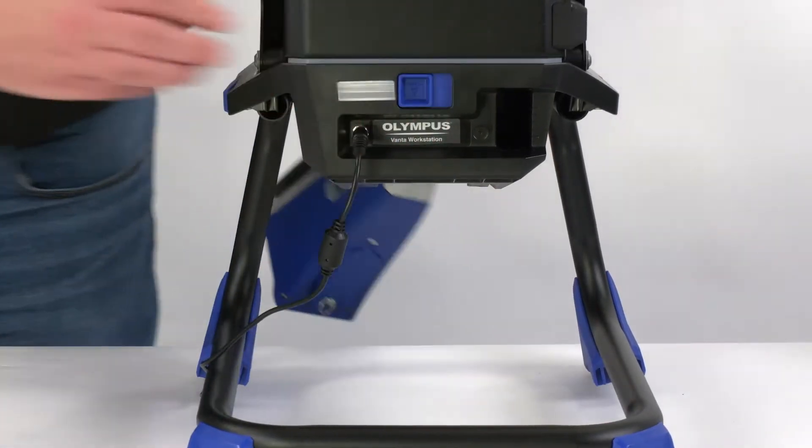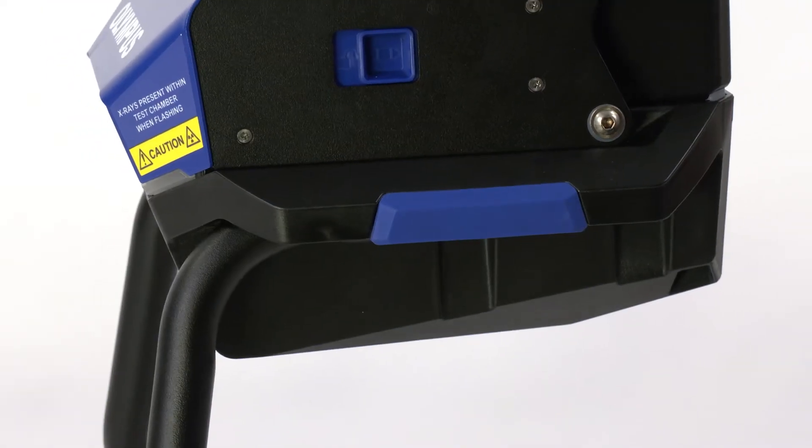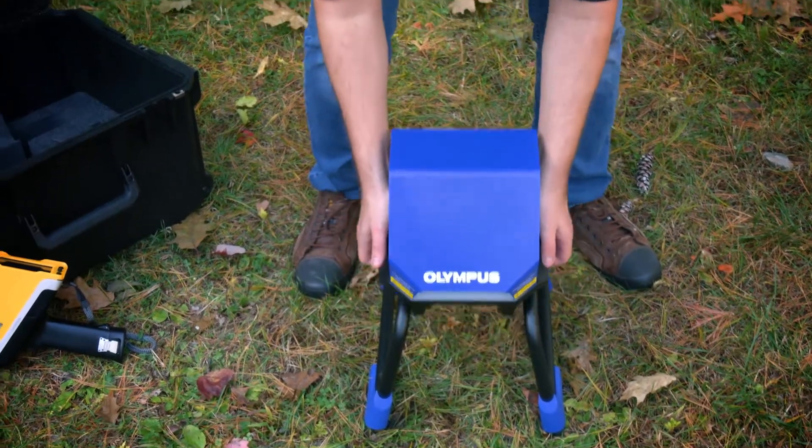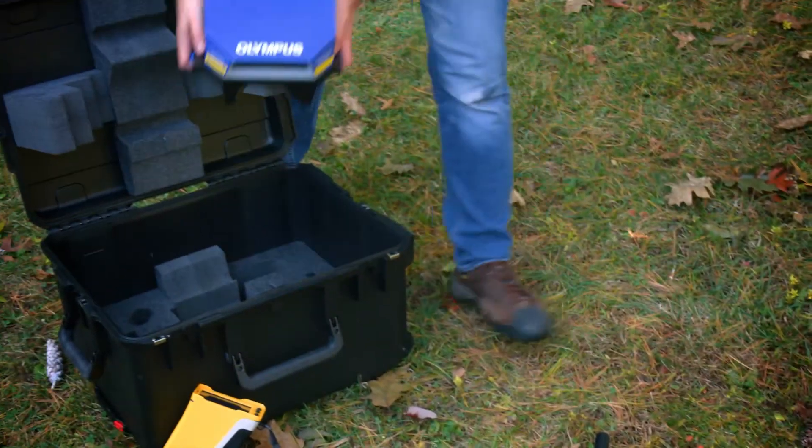When you're done testing, release your Vanta analyzer by pushing a button. The workstation chamber unmounts from the legs with a latch, and can be stored compactly for transport inside the leg space.